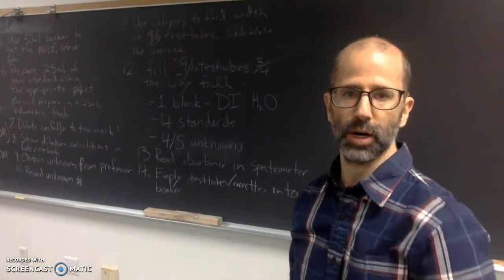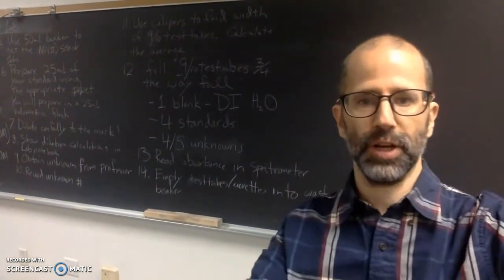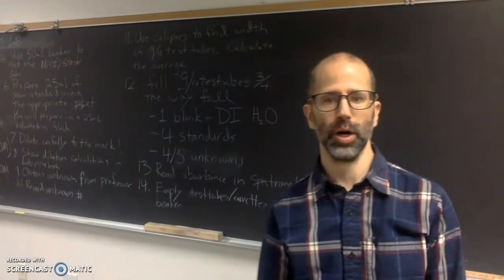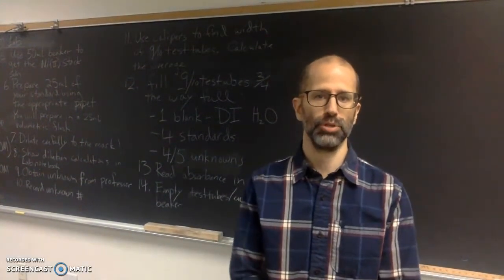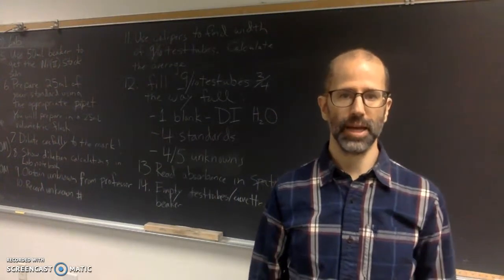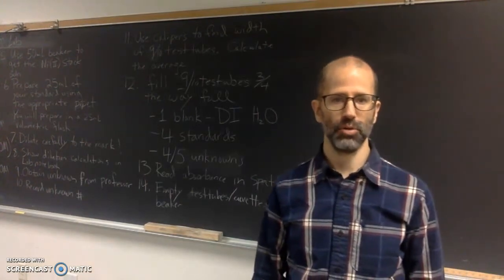I will finish where I left off. There'll be a third video. In the third video I will go over how to use the Spec 20. That's the machine that we will be using to get the absorbance readings of our standards and various unknowns.